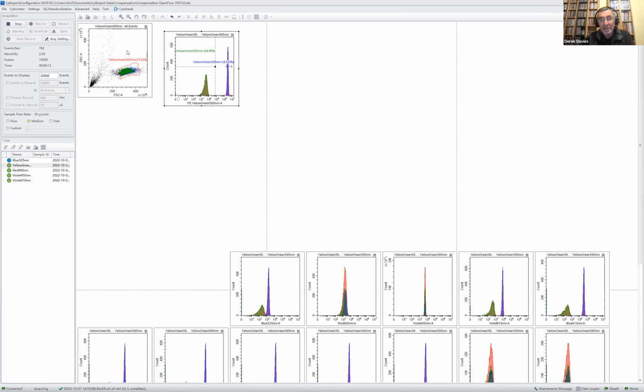APC is a good example. It is reasonably excited by the violet laser, and by the 561 laser as well. Yes, the violet, and you see it in BV 650. People often go, "What?" And it's definitely something we see all the time for sure.